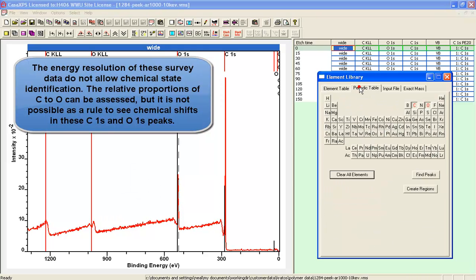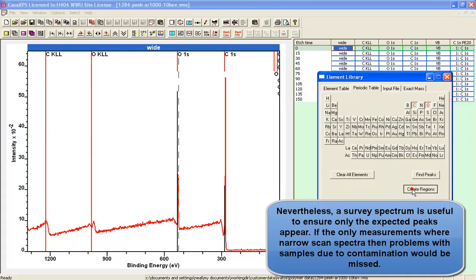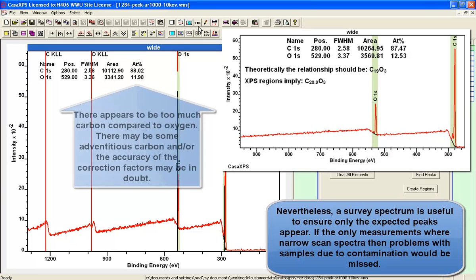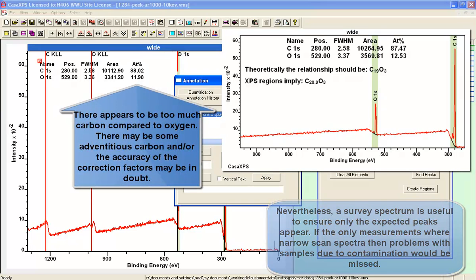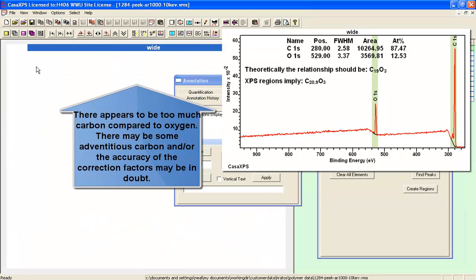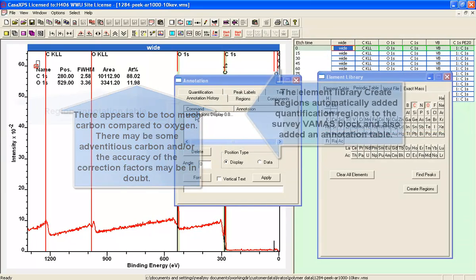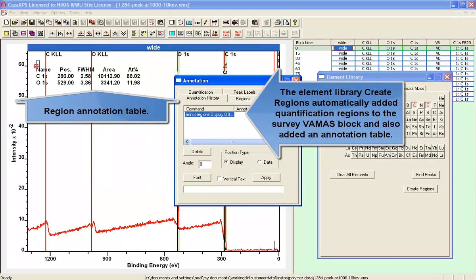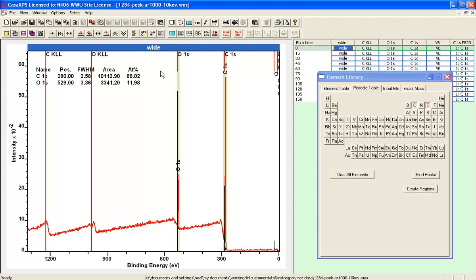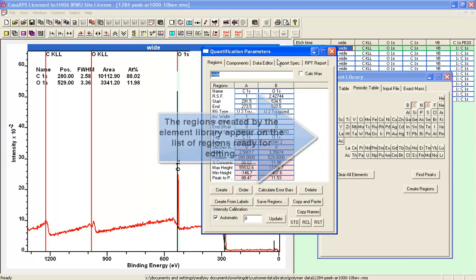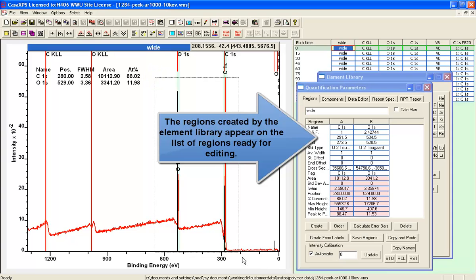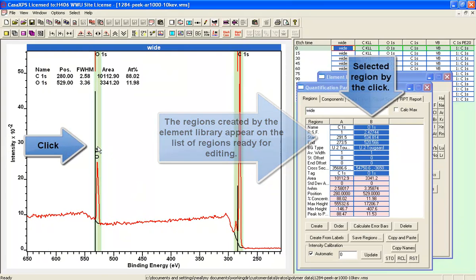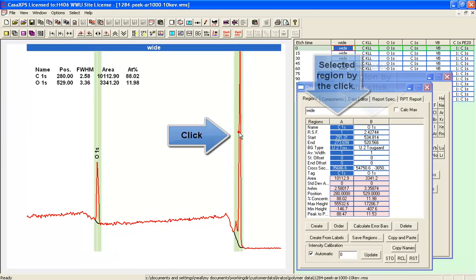In the first instance we'll create some regions using the element library. So we identify the oxygen and the carbon using the element library and say create peaks. This will create an annotation table to show the initial quantification and will have created two regions for the oxygen and the carbon. They now appear on the quantification parameters dialog window.